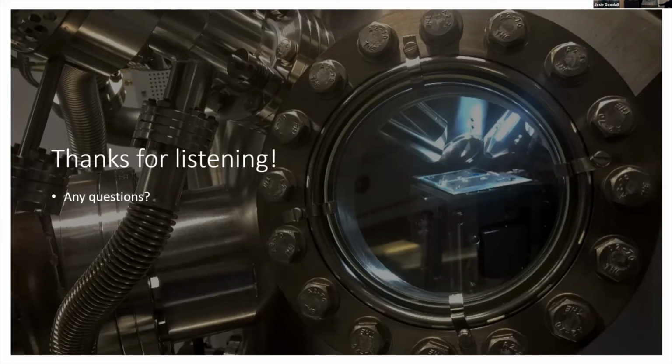Yeah, so the current system is we cool in air, and we're limited to about -30 because of the transfer between the stage and the air. The new system that we've just designed should enable us to get them to much lower temperatures in air before we start pumping.